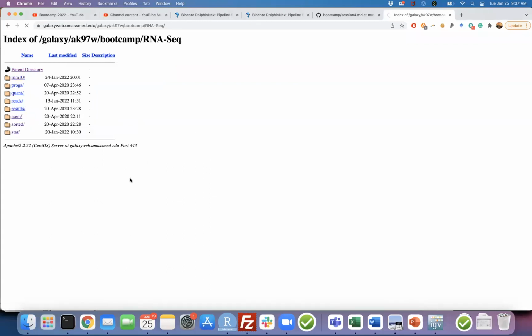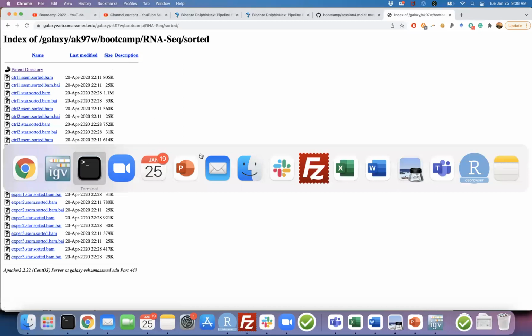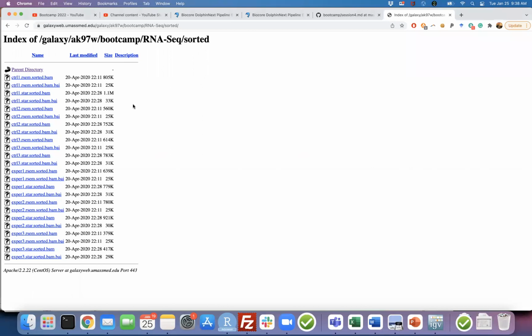But we created all these alignment files. After you run all those steps in session 4, you're going to have these sorted and indexed alignment files. To be able to visualize your files, they have to be sorted and indexed, okay? How you do it is in the tutorial: you use the samtools sort function and put the inputs, it's there, and then the index function creates the index. You write the file name here, the BAM file, and the output name. And then after you create them, you can change the name.